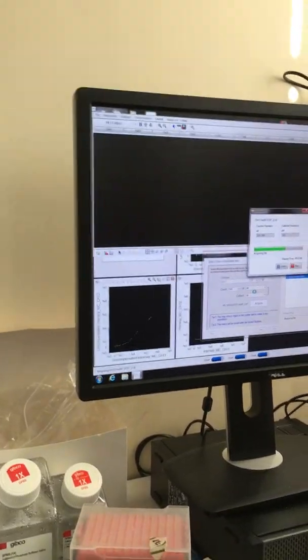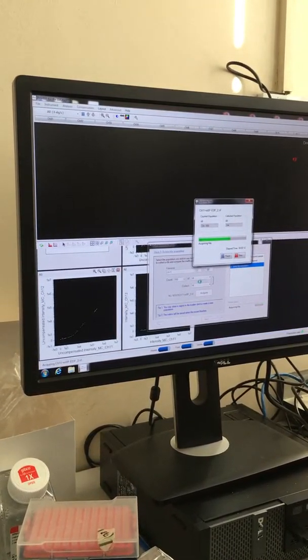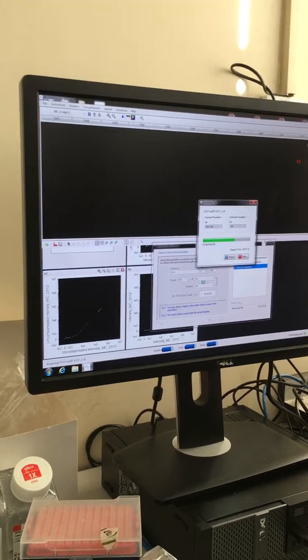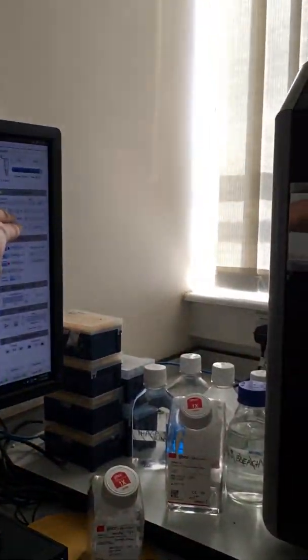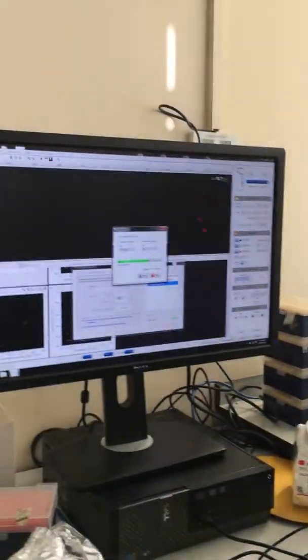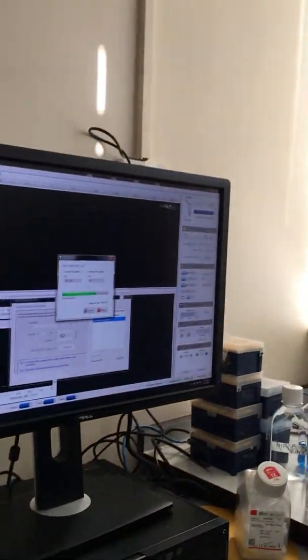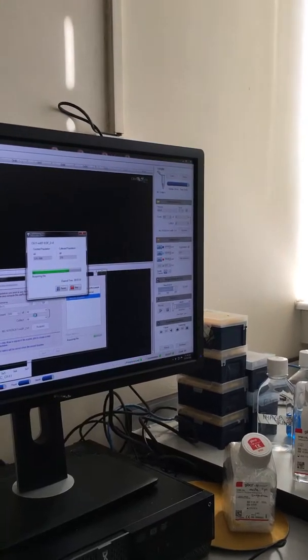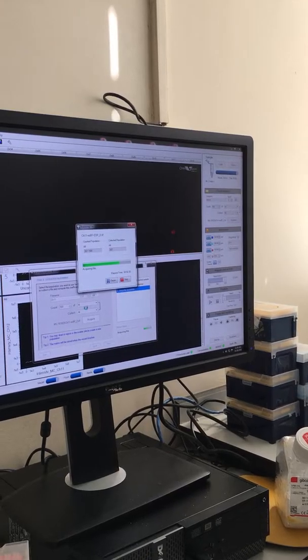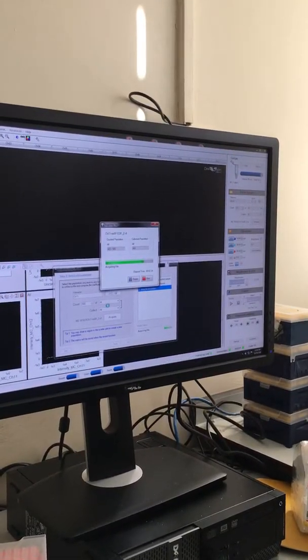But here it's maybe less because it's doing cell by cell. Well, yeah, it takes pictures every time. So I would change your count to something like 20,000 events, which was the best result I had. That's why you need your samples to be super concentrated, to run it faster, because then the rate limiting step is the speed of the machine, not the concentration of your cells.